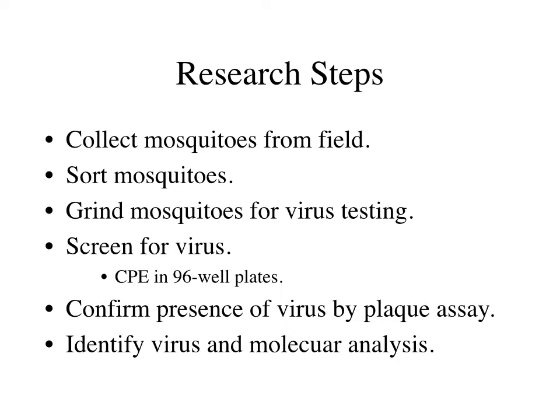But we were able to do plaque assays just on the putative positive samples, not on all 400 plus samples. And so that's what we did. And when you see these plaques, that's a confirmation that the pathogen that you're working with is actually a virus.